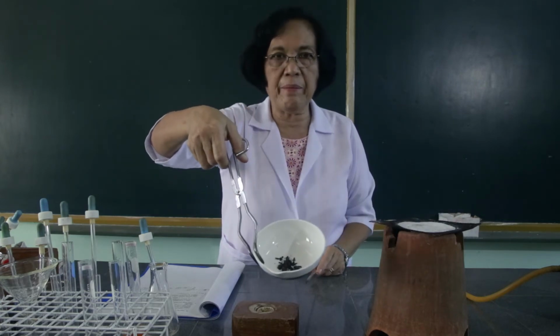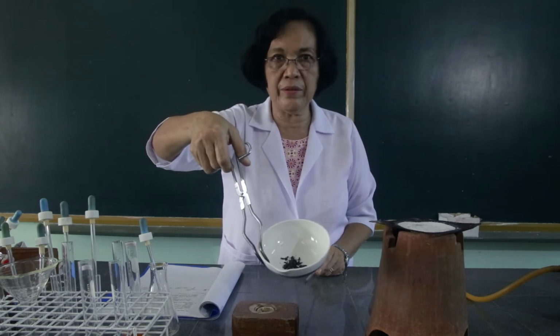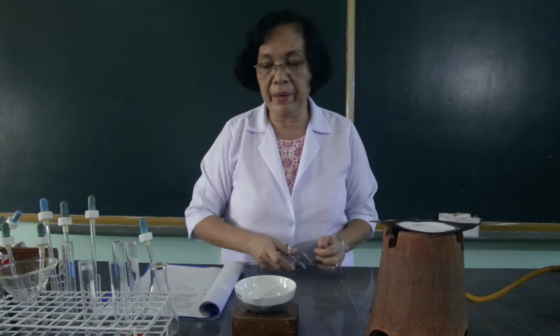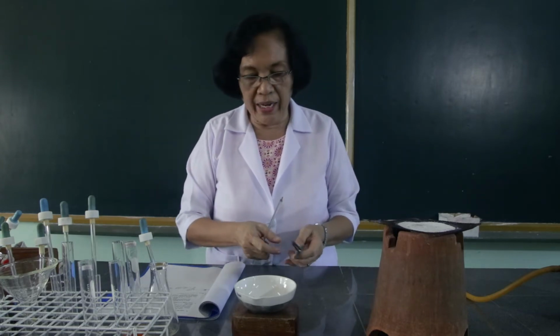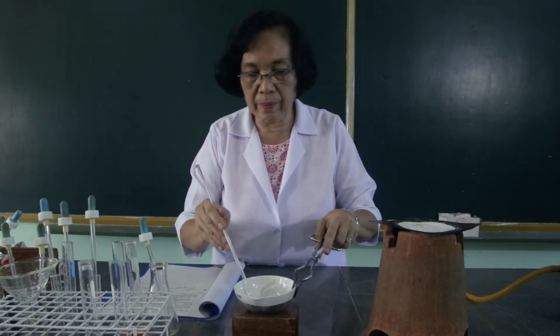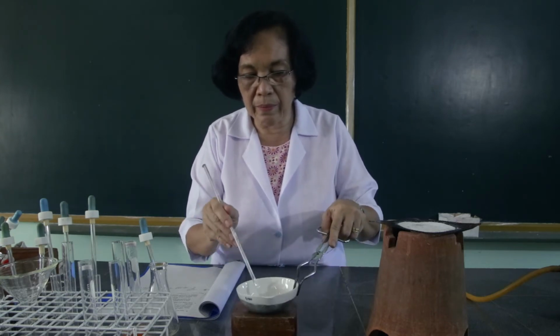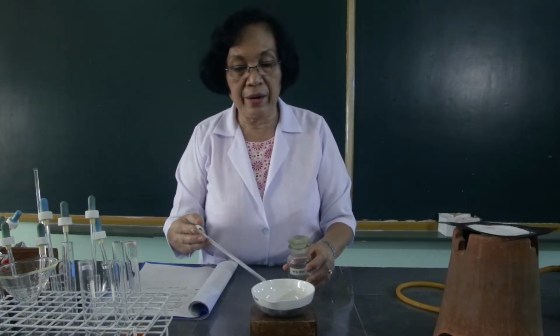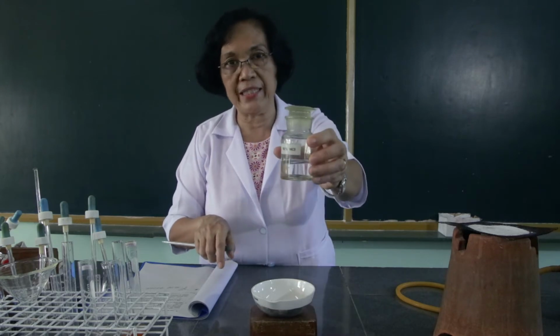So this is already the burned residue, and we're going to cool this a little bit and add hydrochloric acid into it. Then to this burned residue, we're going to add 2 to 3 ml of the hydrochloric acid solution.